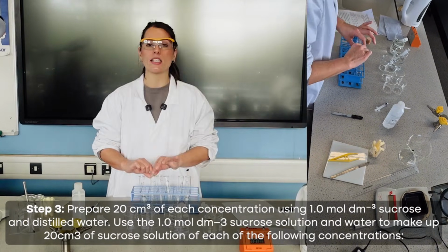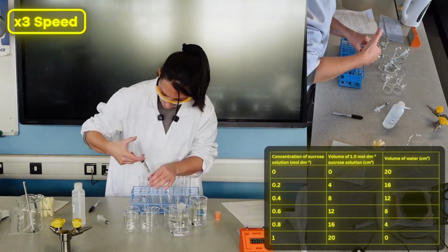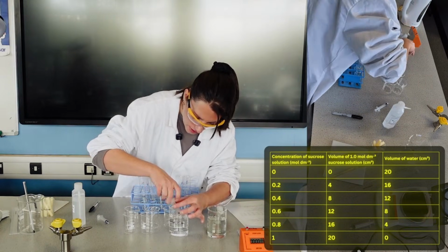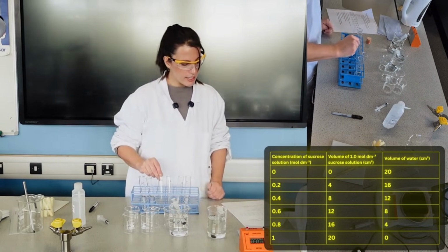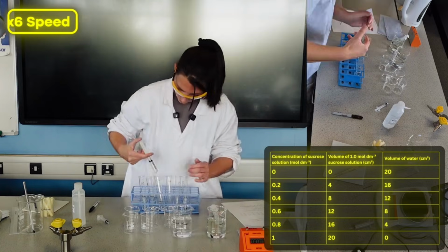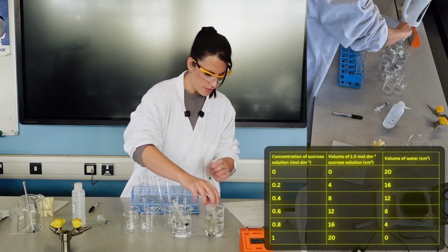Now, the next one that I've got is 0.8. So I need to have 16 of sucrose and 4 of water. So 16, and then 4 of water to add up to 20, so the same total volume. Then we have got 0.6, so for this one I need 12 of sucrose and 8 of water. Now we have our 0.4, which is the reverse of this one. So we now need 12 of water and 8 of sucrose.